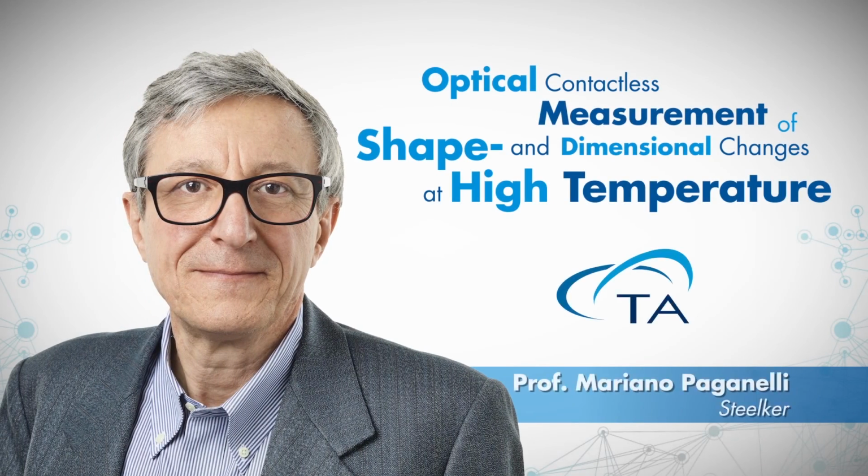Okay, so the questions are coming. So Mariano, we have the first question. What is the largest sample size you can place in an optical dilatometer? Okay, so the 868 can accept samples up to 60 millimeters long in the horizontal configuration and 20 millimeters tall in the vertical configuration. These are the size limits for optical dilatometry. So pretty straightforward.